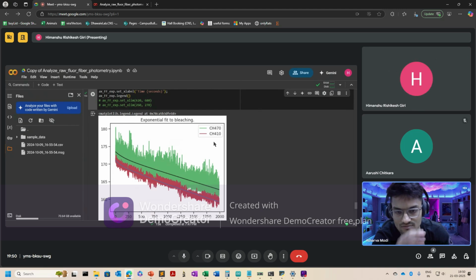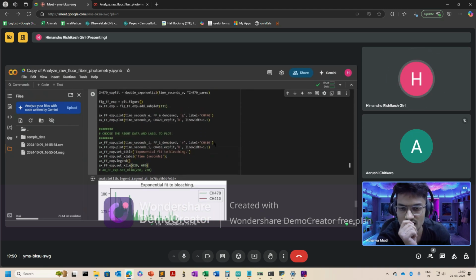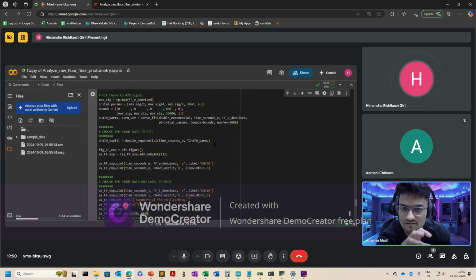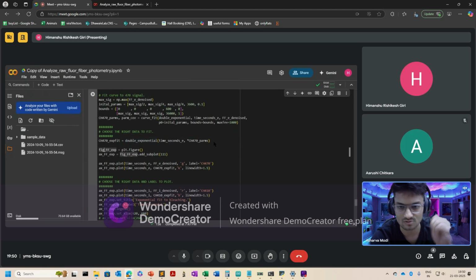So this is something which disables us from mass analyzing all the sessions together. I can't do that; I have to see each one by one. I have to look at these graphs carefully, so that these kinds of things should not be significant.